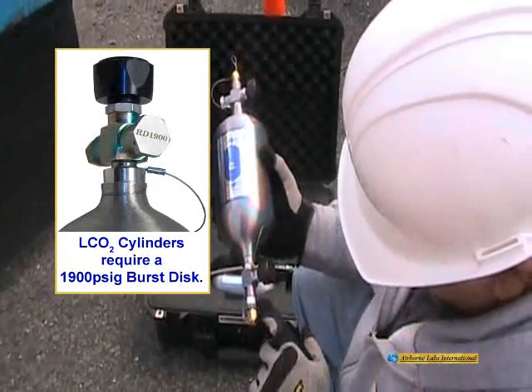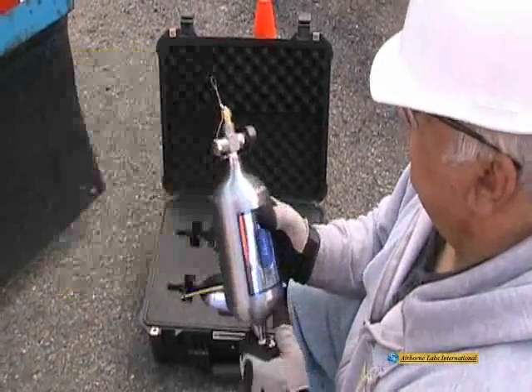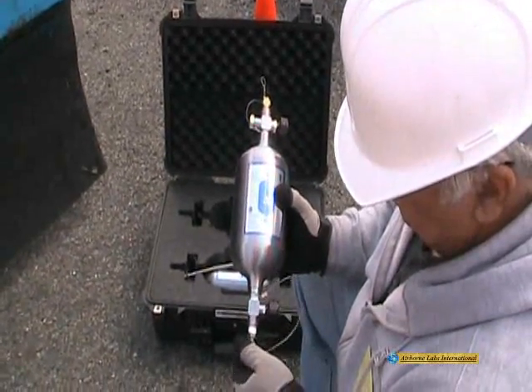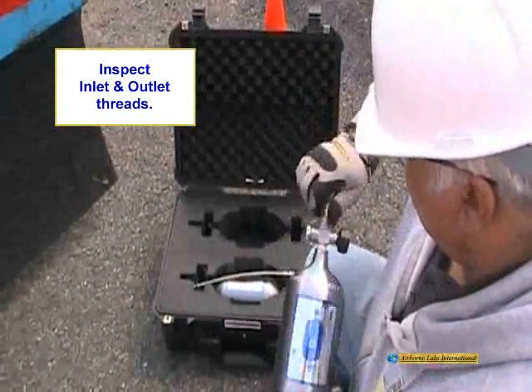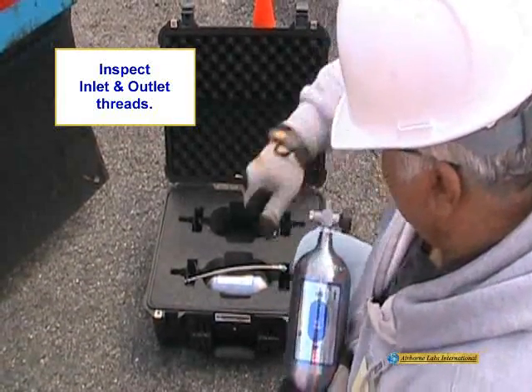A 1900 PSIG burst disc is the correct rating for a 1-liter liquid CO2 sampling cylinder. When removing the end caps, the threads should be examined for damage, as damaged threads could introduce contaminants during the sampling process.